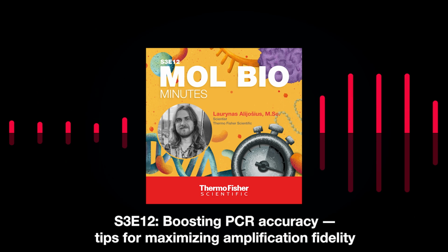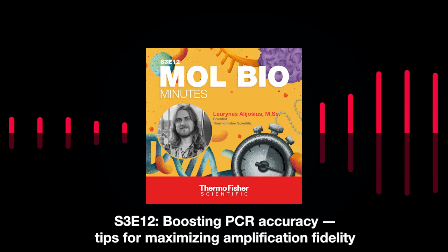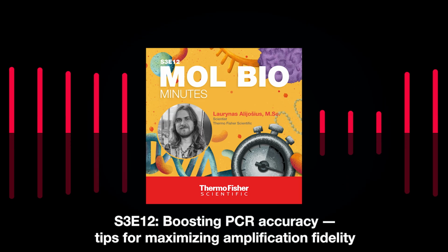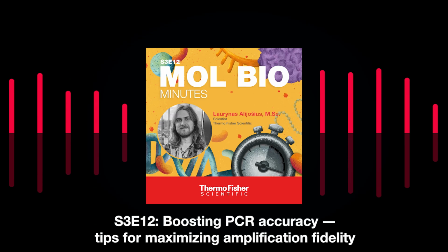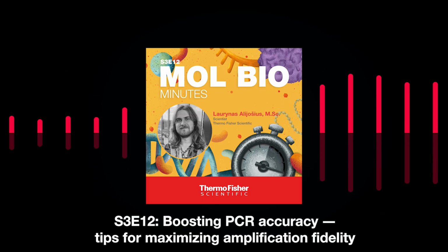And finally, for the whole PCR program, try to limit the number of overall PCR cycles to the minimum. I would say a good starting point here is like 30 cycles. Start with 30 cycles and then test your PCR product, see if it's good. And if it's a good product, then you can get that number of PCR cycles to an even lower level and just test it out and see if it works, if the yields are enough and things like that. So the principle here is simple. Having fewer PCR cycles means that there will be fewer amplification errors that will be reintroduced and multiplied in the following cycles of the PCR.